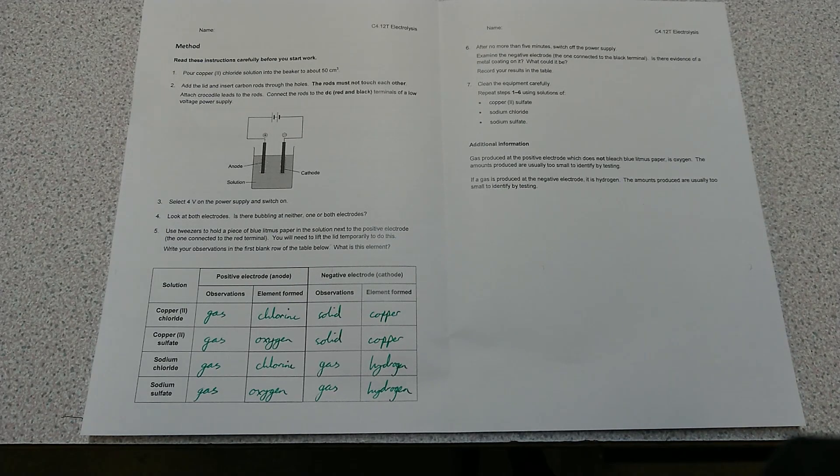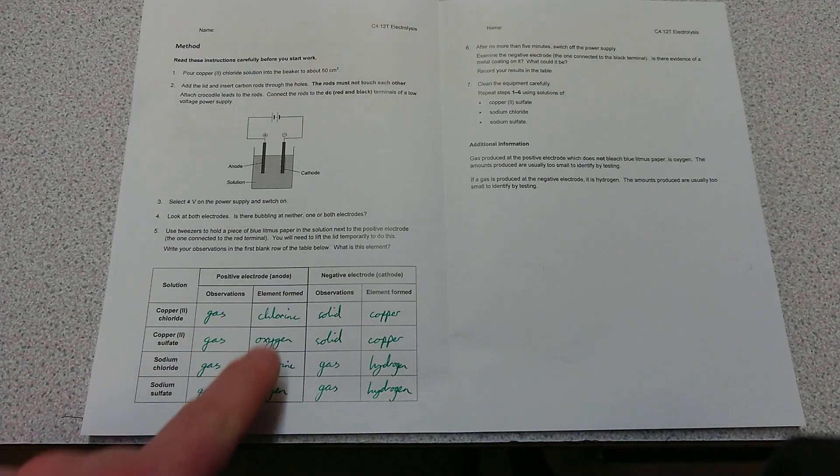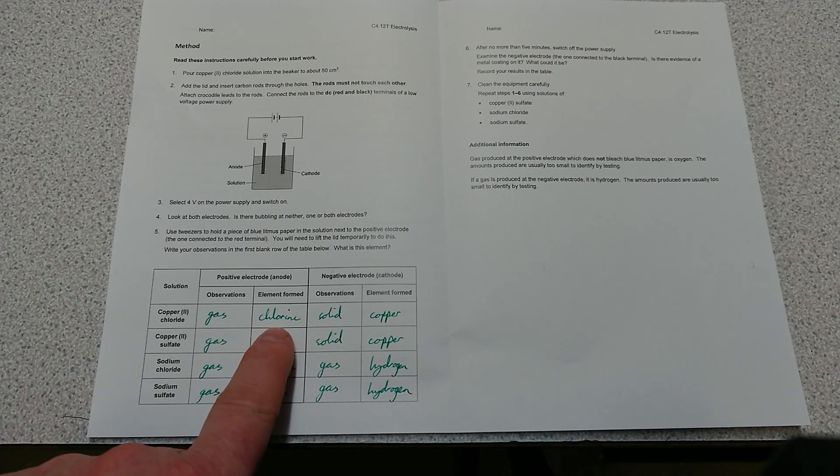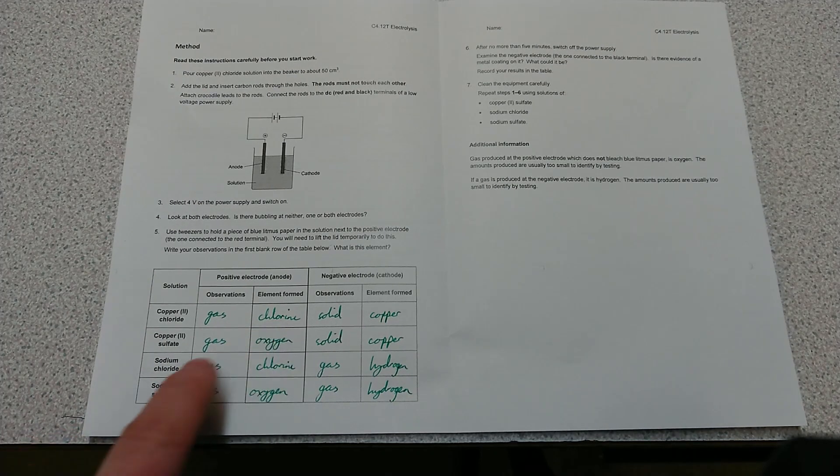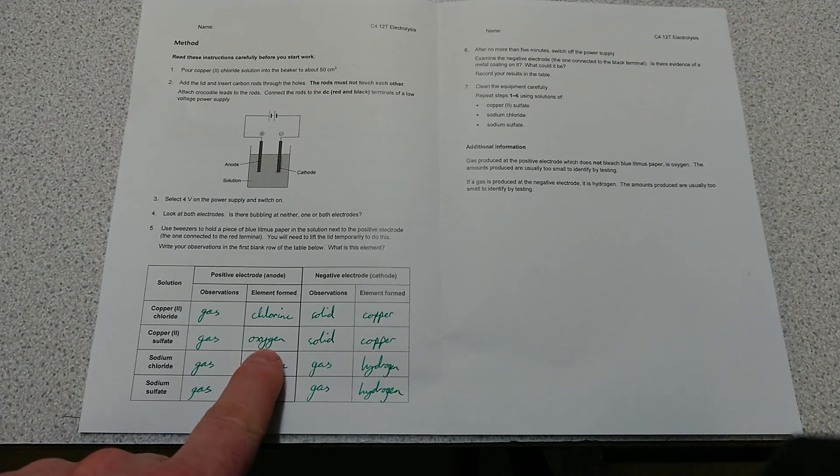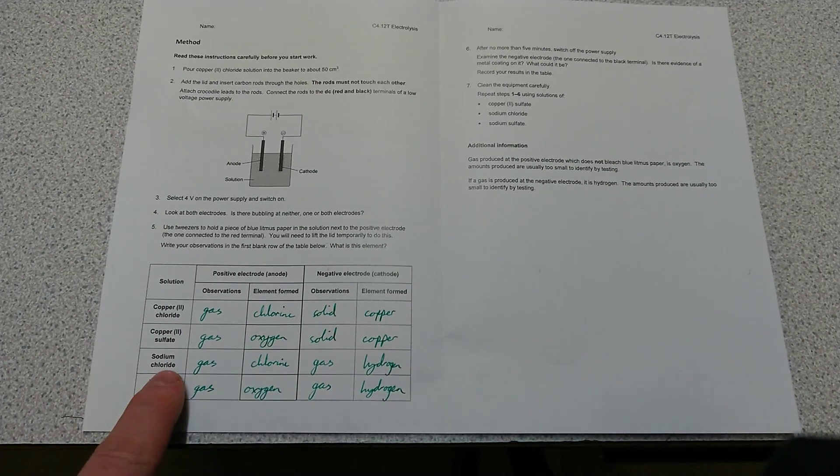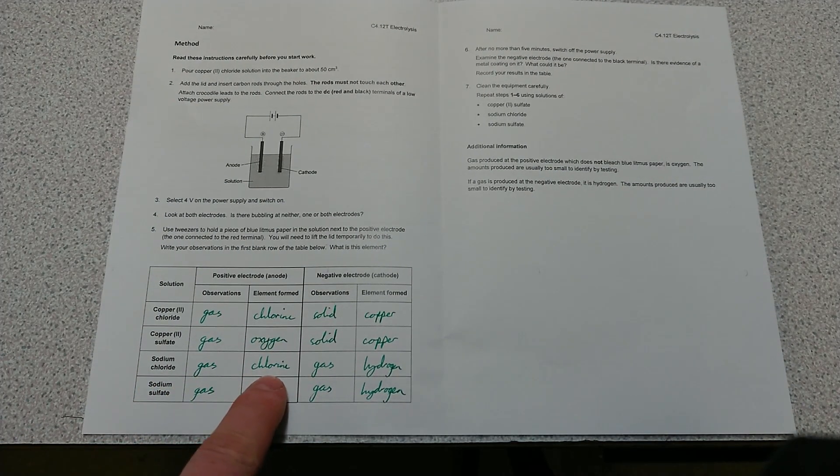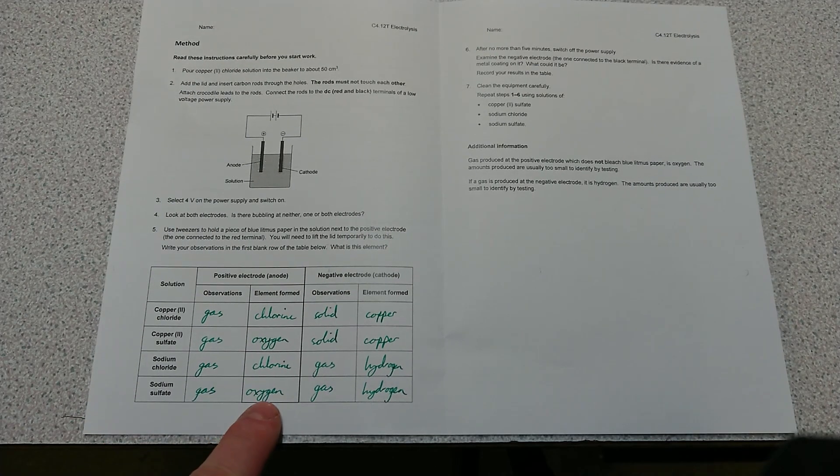So in summary, we can see what we've got given off at each of the electrodes. At the anode, for copper chloride we got chlorine given off; for copper sulfate we got oxygen given off; for sodium chloride we got chlorine; and for sodium sulfate we got oxygen.